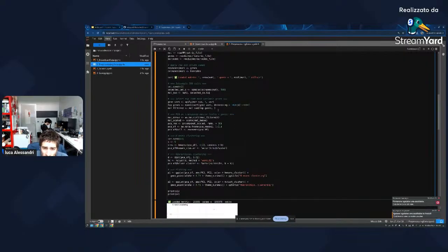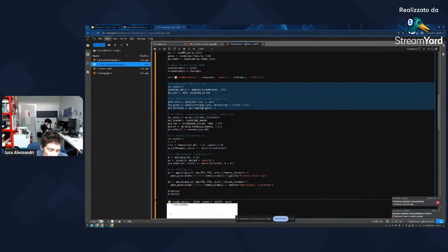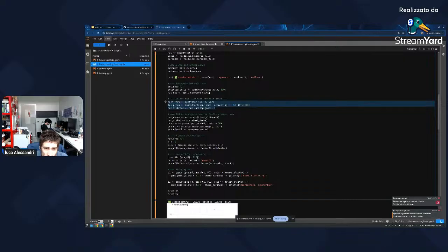Okay, after I filter this, just for the sake of time so far, and this one is for, I don't know, removing the noise, I will apply a PCA that is like a projection, from a high dimensional space to a two-dimensional space. I just want to highlight again, this is wrong, okay? It's wrong to use PCA over a single cell RNA-seq matrix, but I just want to show you what the outcome is and why we need other clustering algorithms.